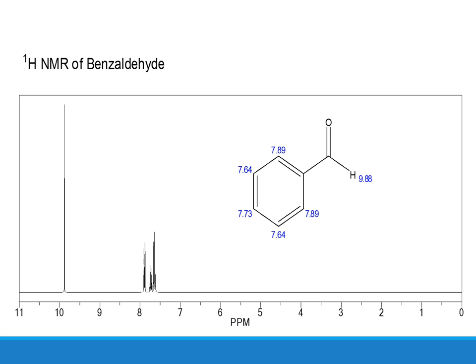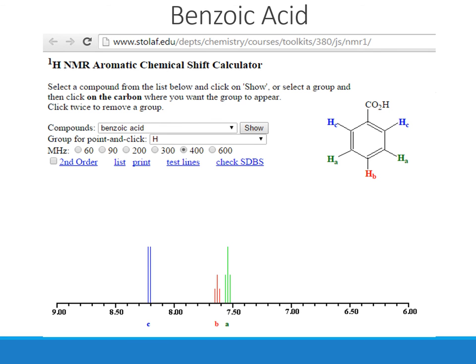The NMR of benzaldehyde is also presented. It is important to note that aldehyde and carboxylic acid protons have the most downfield values in the PPM region, appearing at almost 10 PPM, compared to the aromatic region which is usually around 7 to 8 PPM. A web page is provided to generate different types of molecules, generate their proton NMRs, and study them independently.